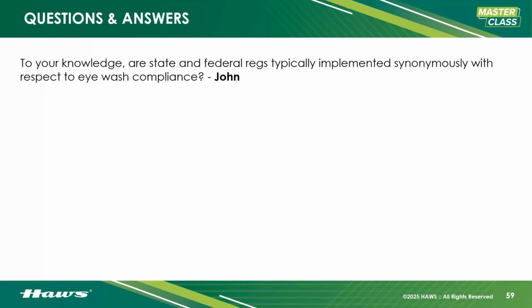They have to be more strict than what's required at the federal level, but all have to be considered when you're looking at equipment and testing it and ensuring compliance. You want to ensure that local considerations and requirements are taken into consideration at the same time. Don't allow one to go by without looking into the other. That's super important, because there are some weird ones out there.